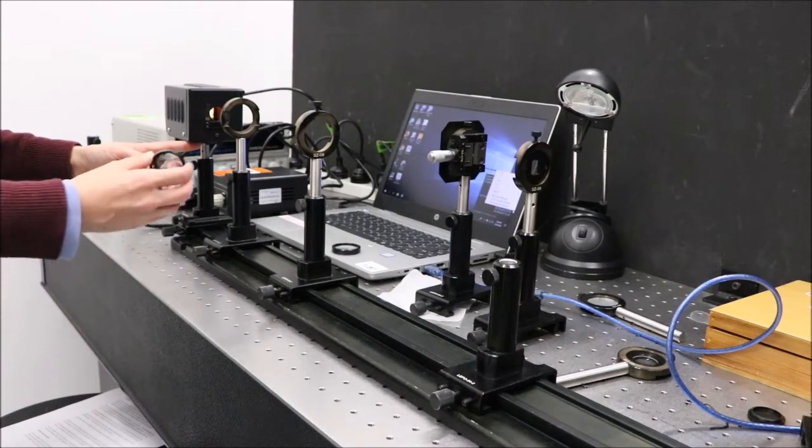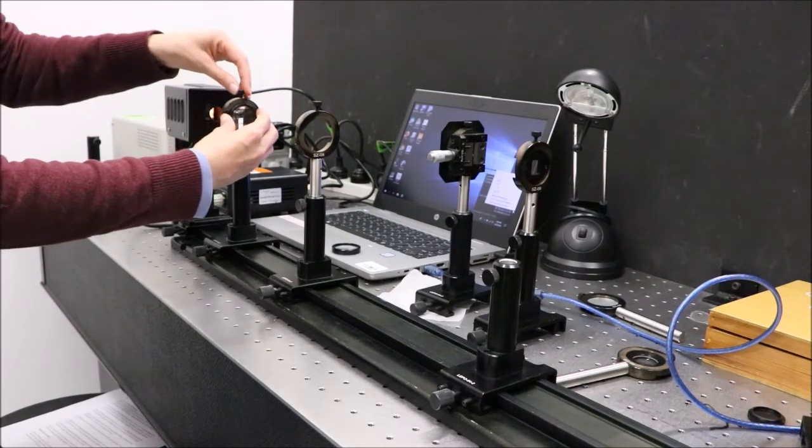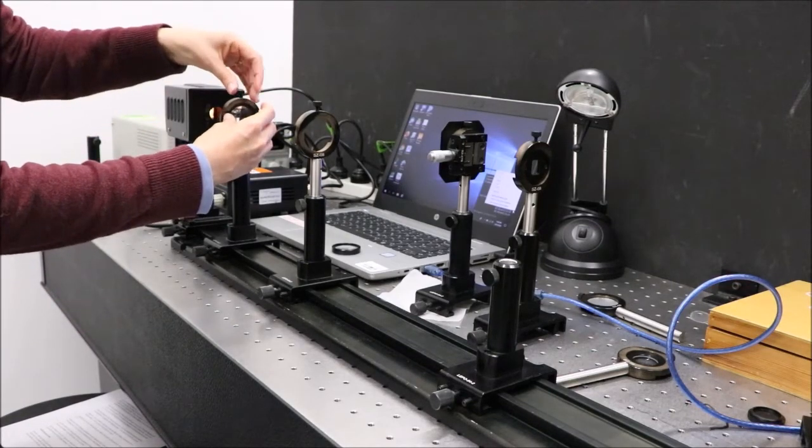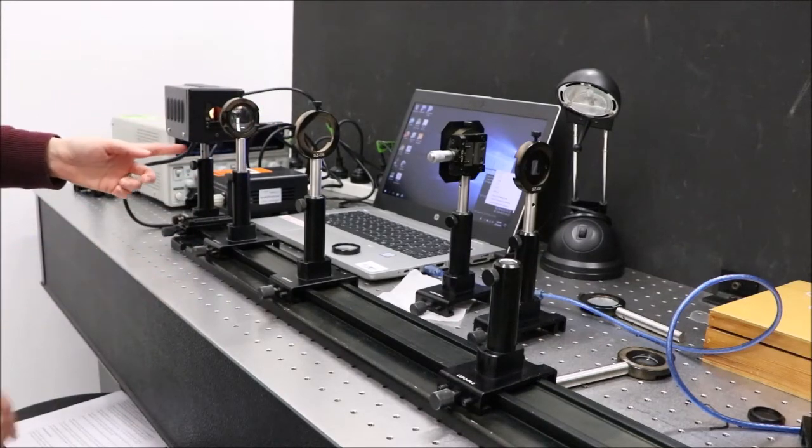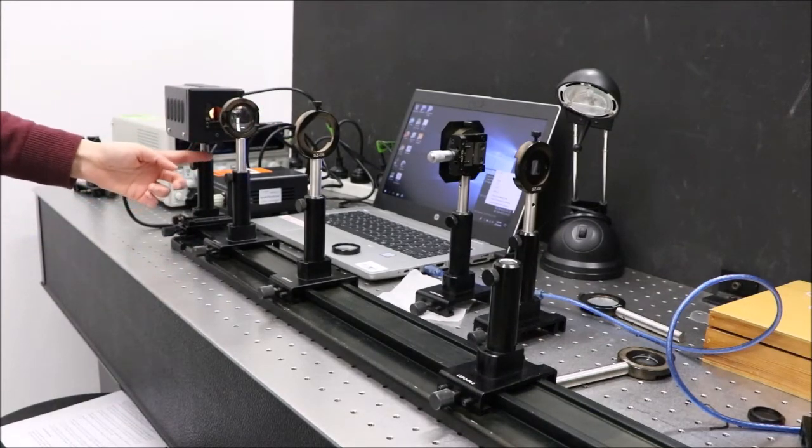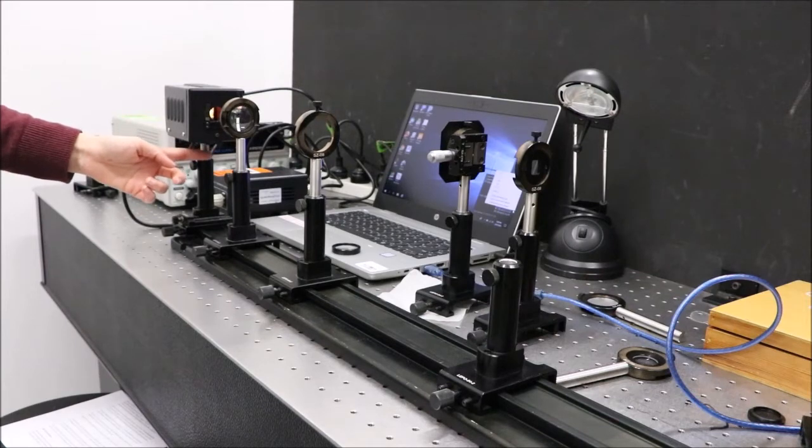We're going to put the collector lens in and make it about 10cm from the source. The source is located just in front of the post.